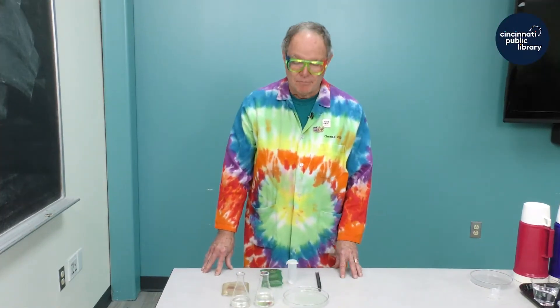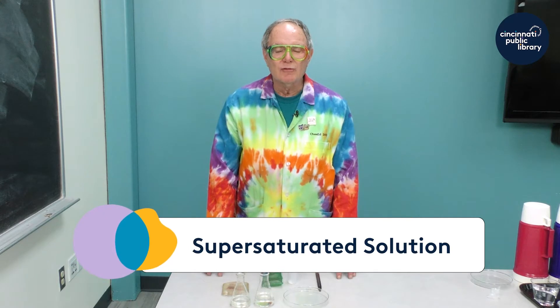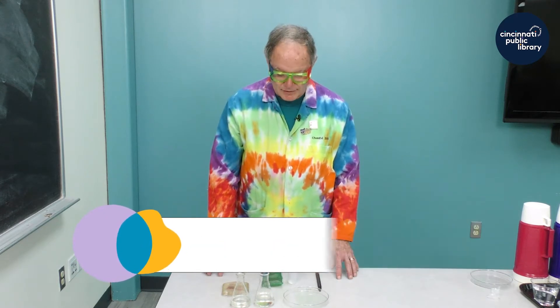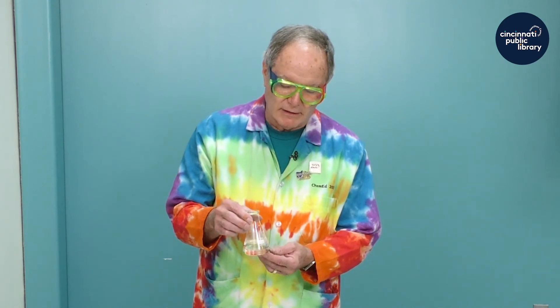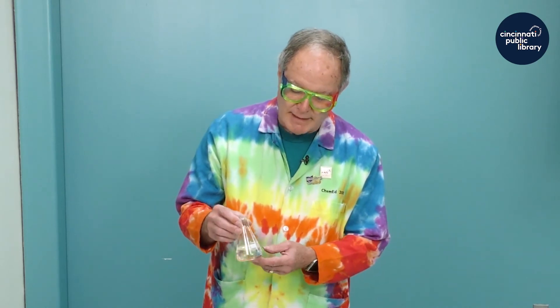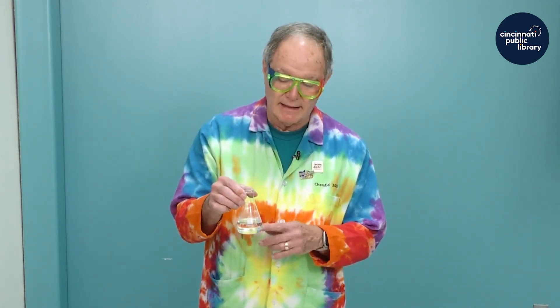Welcome back. In this demo, we're going to talk about a supersaturated solution. In the flask, I have a solution of sodium acetate. It is a white crystalline material that looks like table salt. I dissolved it at a very high temperature and then I let it cool to room temperature. The demo indicates that most solutions, there's only a certain amount of solid that can dissolve.